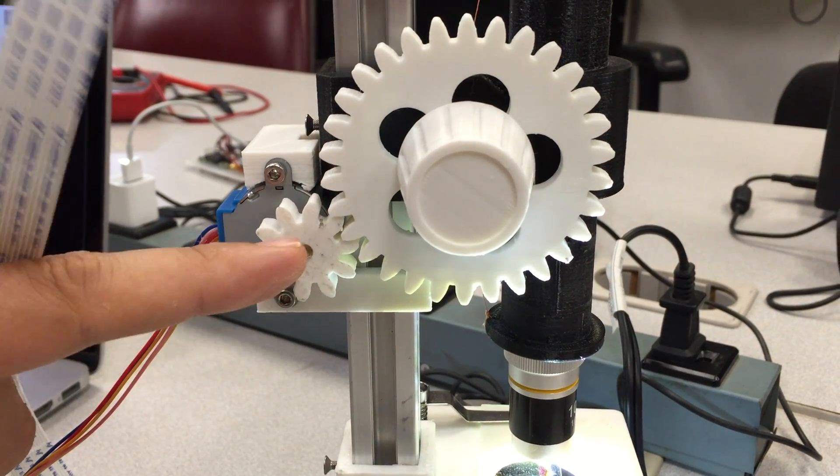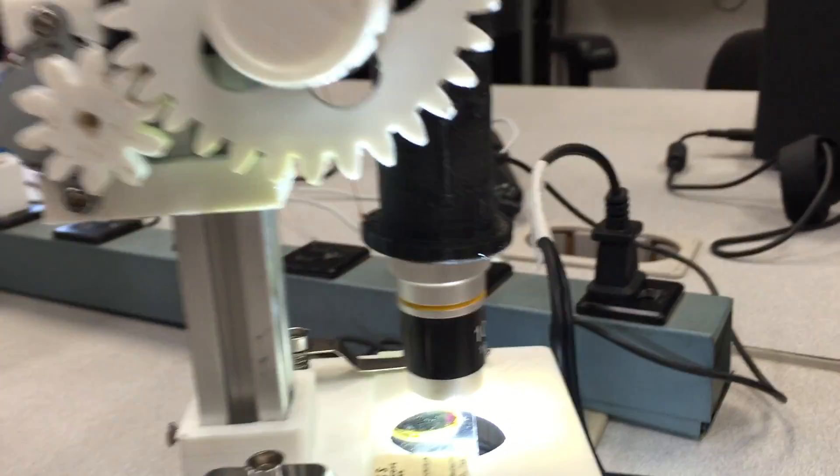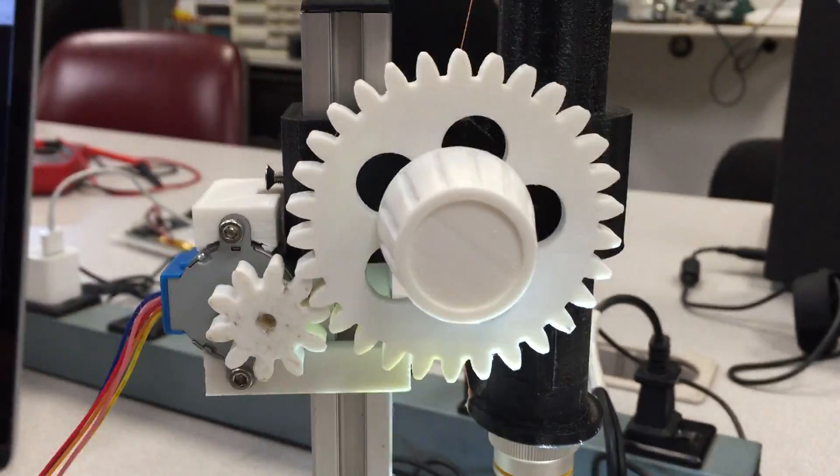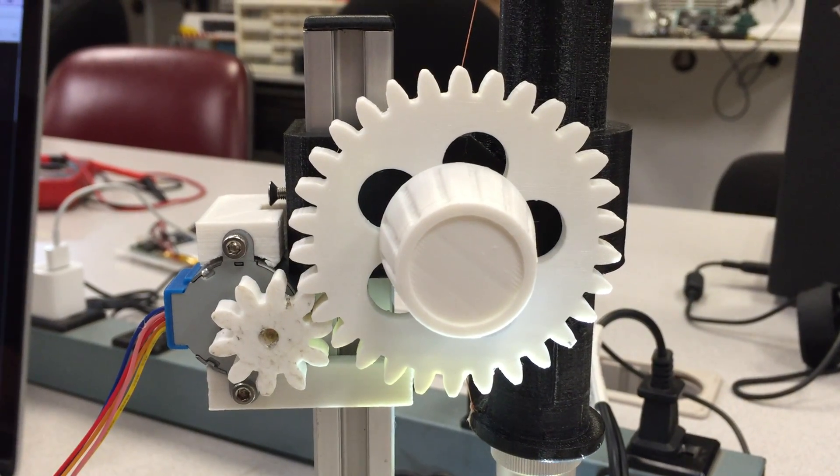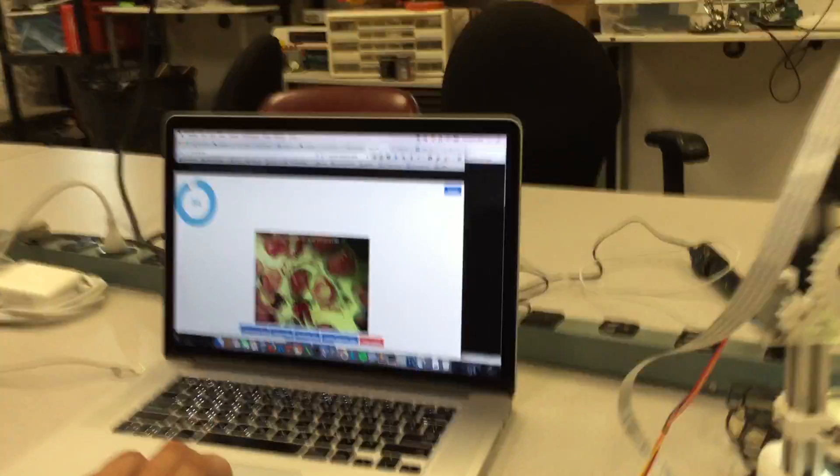I mean this barely is even registering right here. Whereas I can also go the other way. And again, it's one of those where the higher up I go on the dial, the greater the adjustment.